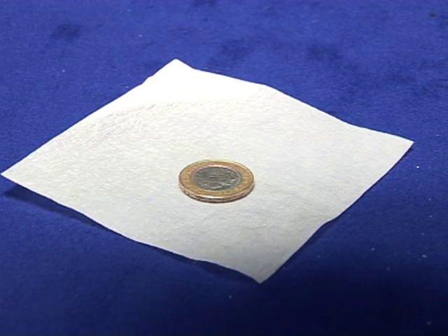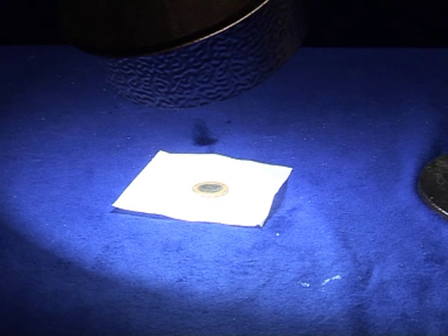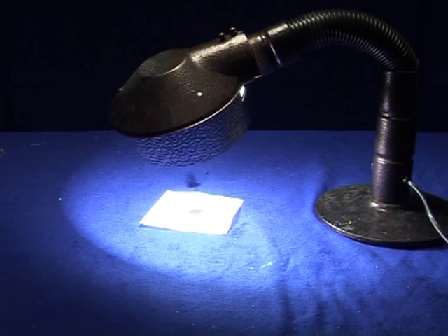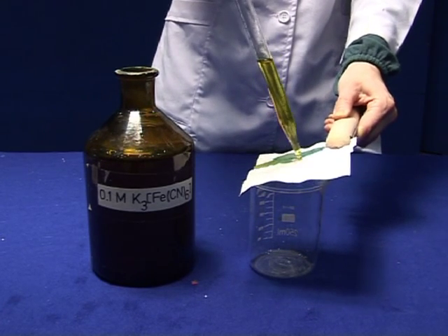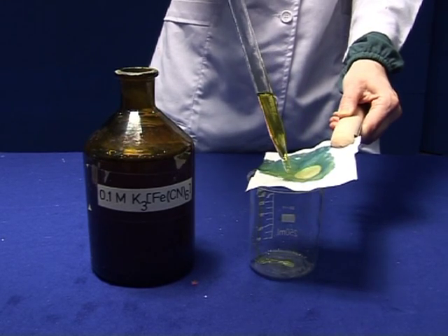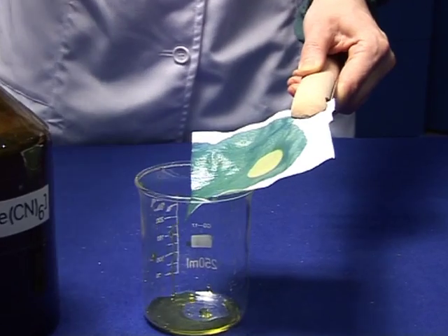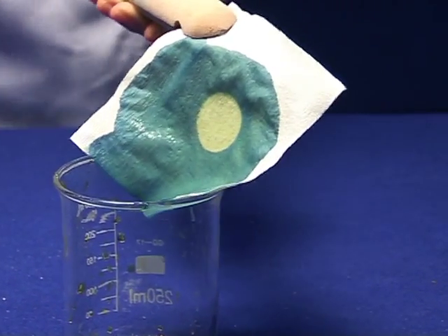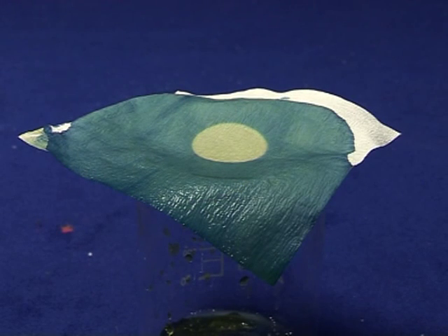After drying the filter paper in a furnace for a few minutes, place an opaque object on the paper and irradiate it for a few minutes using a light source. Take the filter paper from under the light source and wet it with potassium ferric cyanide using a pipette. Bear in mind that this ferric cyanide solution is poisonous. Record your observations.